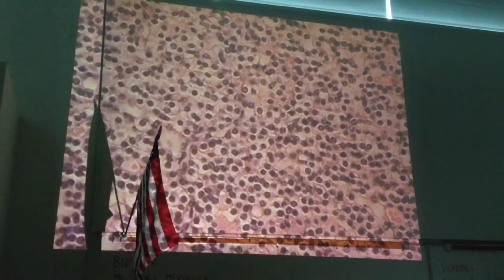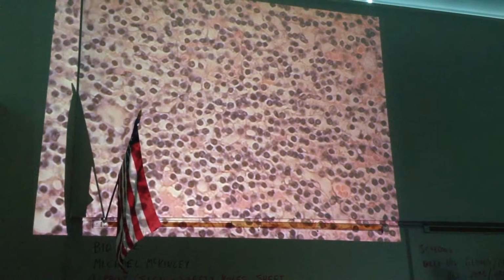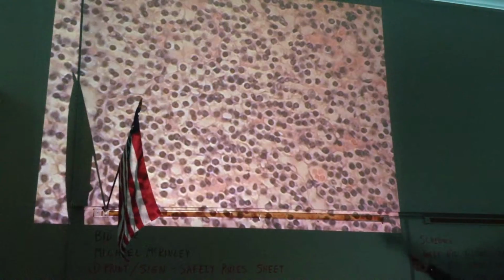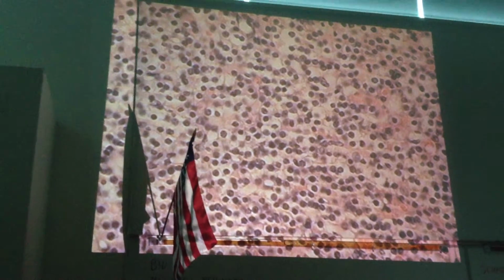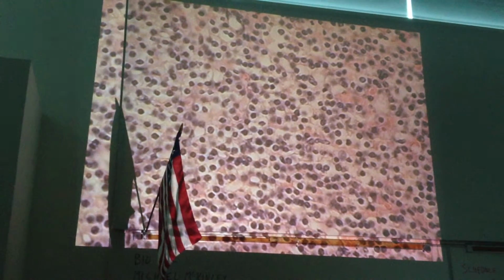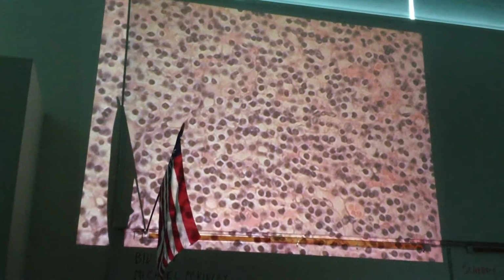Now, let me go up in, all right, nice view here. Here's a blood vessel with 4 red blood cells in it. Now that's pink. Now pink is going to be a distinguishing feature when we look for oxyphils, and I'll point that out, but they have a nucleus. But when we look at the cells that have a fairly large nucleus and a completely clear cytoplasm, those are the chief cells. They are the ones that make the parathyroid hormone. So they're clear cytoplasm, large spherical nucleus, and as I said, clear cytoplasm.